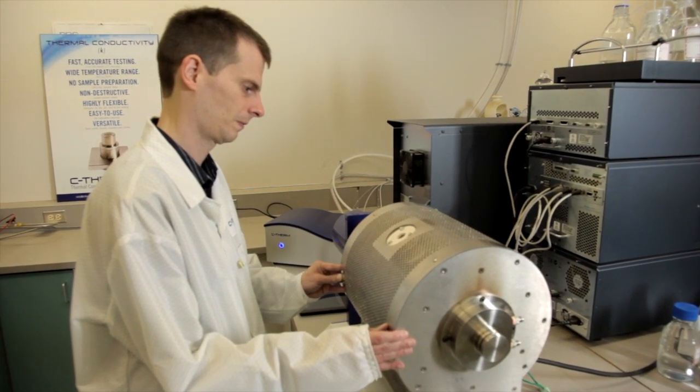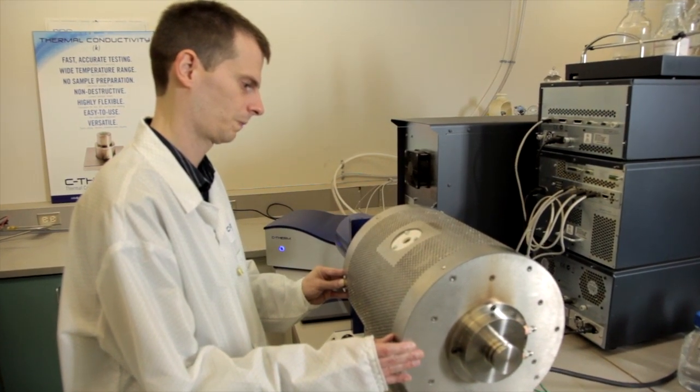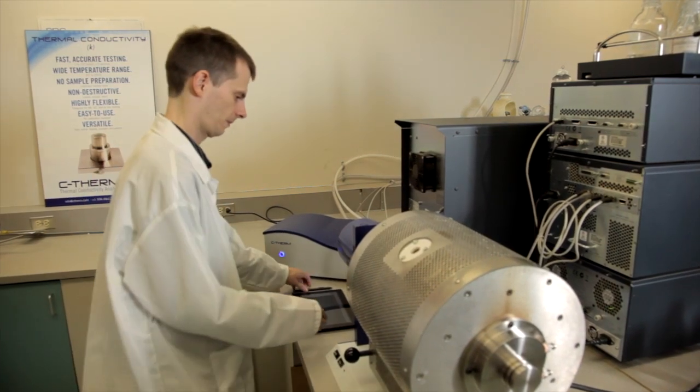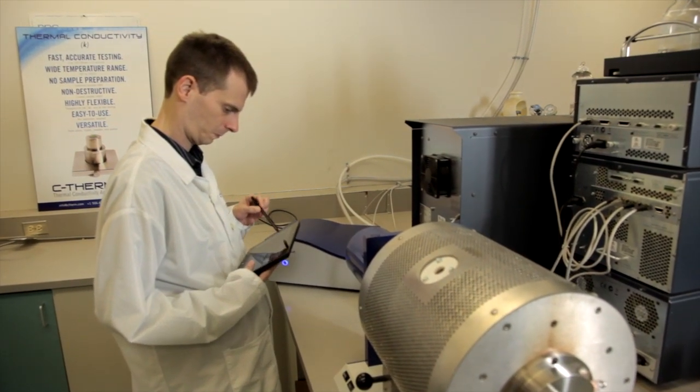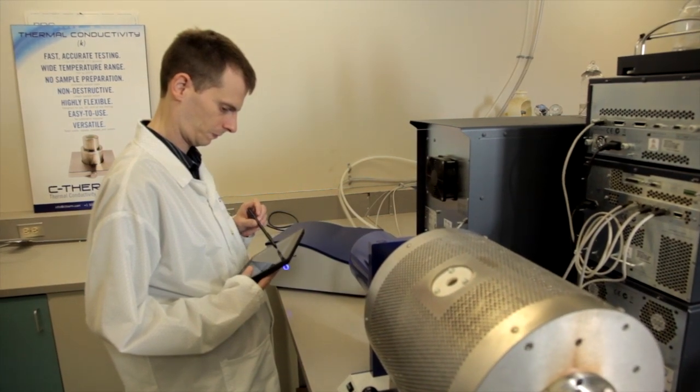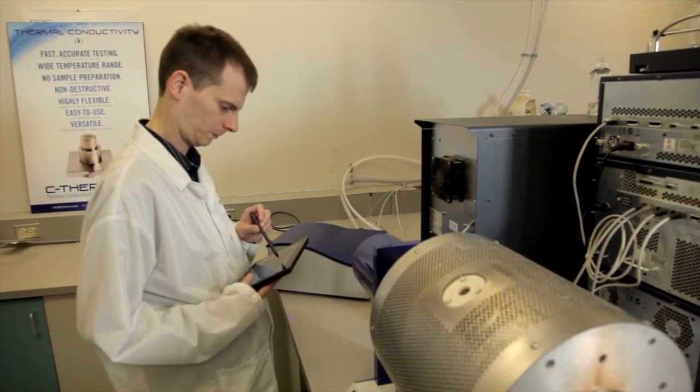Differentiating itself in offering researchers greater ease of use and modularity, C-Therm dilettometers leverage the TCI's advanced controller and present a wide range of options.